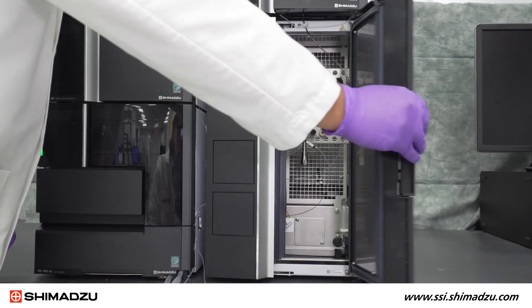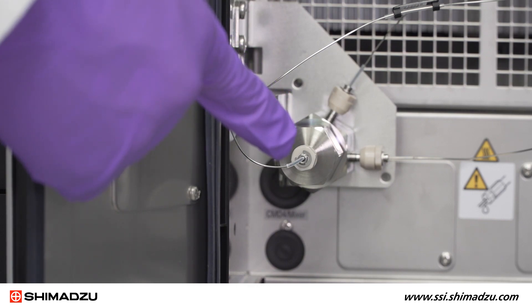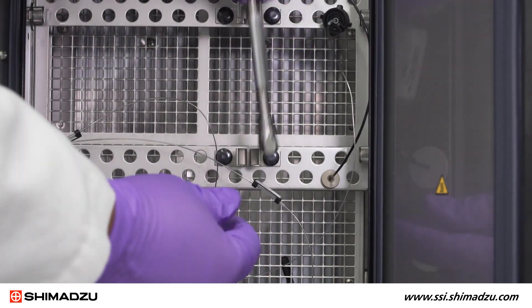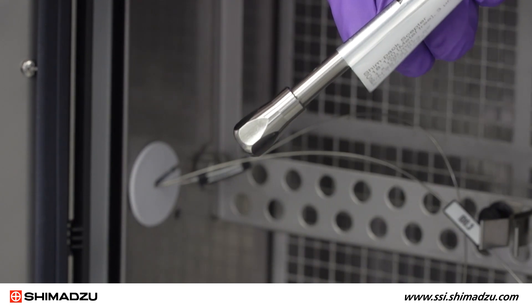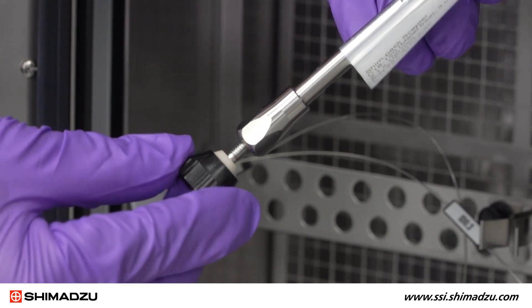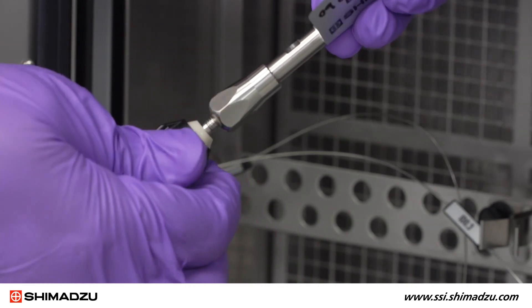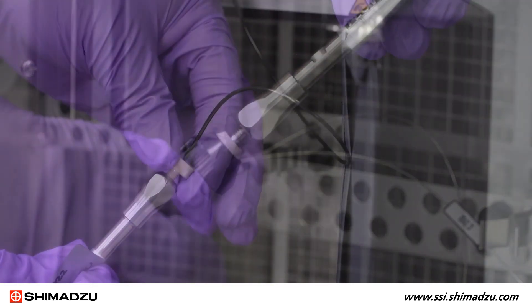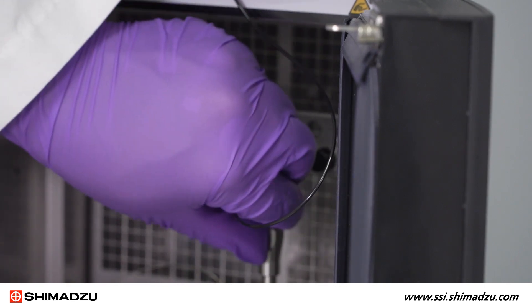Inside the column oven, you will see our inert mixer made from corrosion-resistant titanium alloy. If you look here, you will see our Shimpak Scepter metal-free column. PLS is installed using a finger-tight ratchet and fittings. To install, simply insert the ratchet fitting in the bottom of the column or the valve and tighten until you hear two clicks. Connect the last finger-tight fitting like so, and your PLS is now installed.